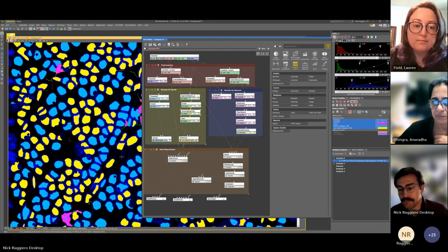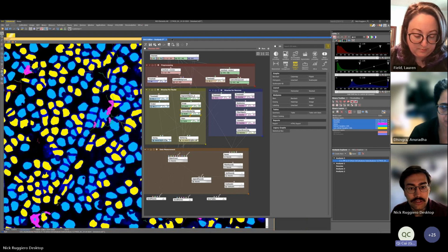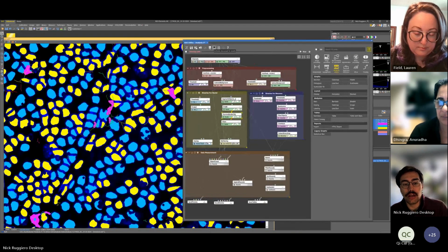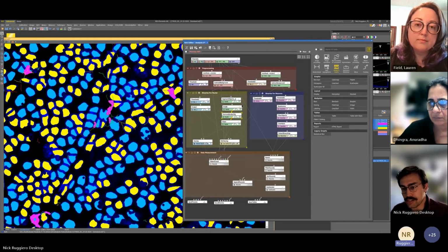Yeah. So one of the questions I have is, given the manipulation you did to this particular image, can you just apply it to future images, or will that alter the amount of background that's there, for example? So if this is essentially a pretty well done GA3, I believe I only ran it on this one image.